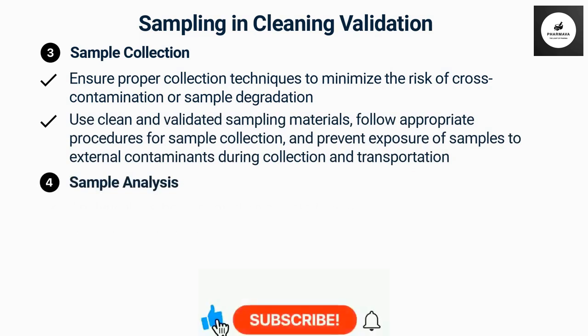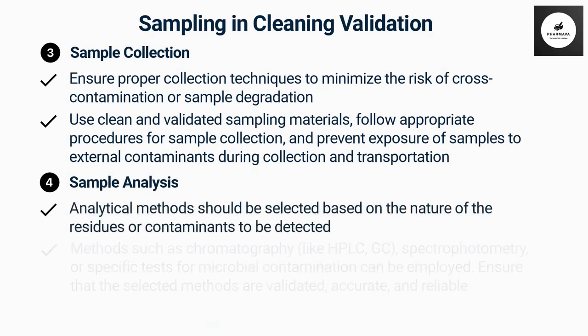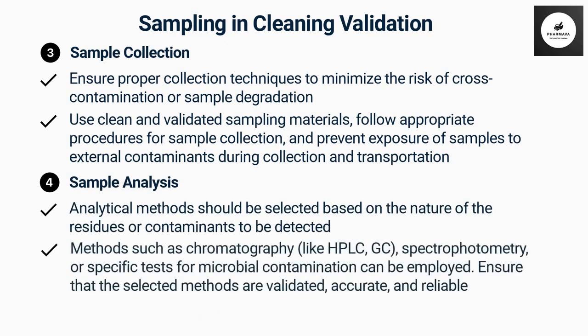Sample analysis. Analytical methods should be selected based on the nature of the residues or contaminants to be detected. Methods such as chromatography, like HPLC, GC, spectrophotometry, or specific tests for microbial contamination can be employed. Ensure that the selected methods are validated, accurate, and reliable.